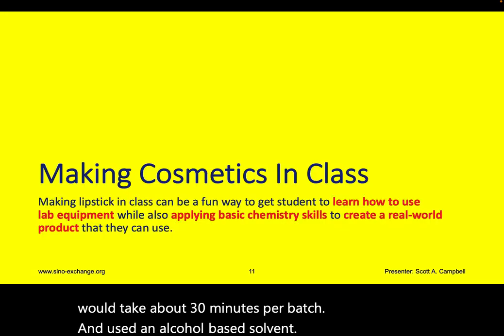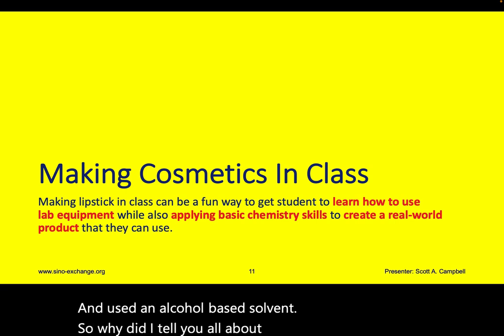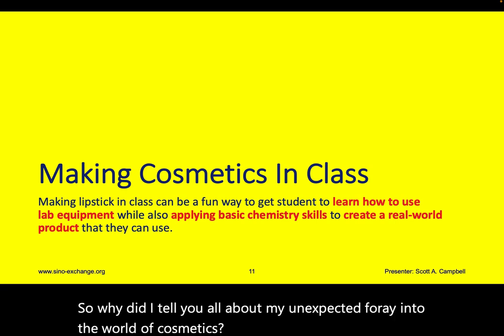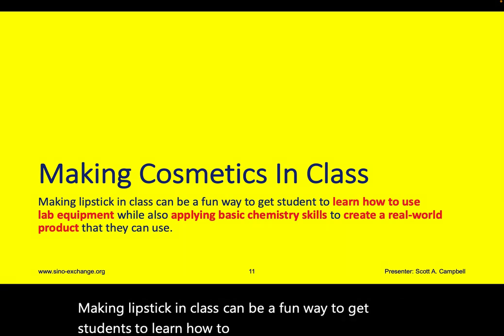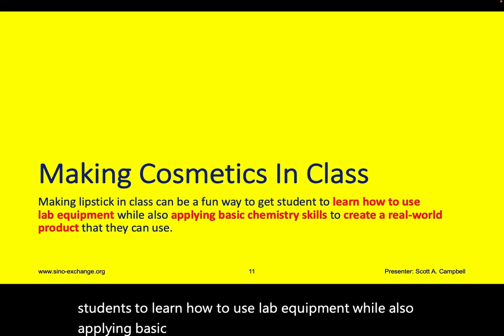So why did I tell you all about my unexpected foray into the world of cosmetics? Well, making lipstick in class can be a fun way to get students to learn how to use lab equipment while also applying basic chemistry skills to create a real-world product that they can actually use.